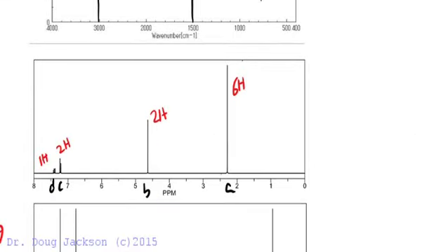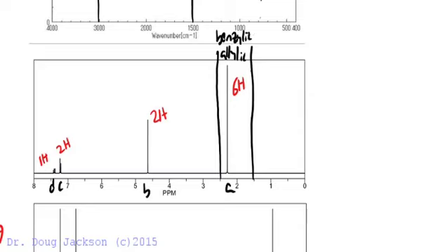And in our hydrogen NMR, we draw our line. So this is the alkyl region here, the allylic, or in our case here, allylic slash benzylic terminology. Next door to a double bond or a benzene ring shifts to the same place for the most part. So alkyl, nothing. Allylic, we have something to 4.5. We have nothing in this region. And then at 6.5 to 8.5, we definitely have a dead giveaway, 3 protons in an aromatic ring. Okay, so we've definitely got it in there, and we've got to account for it in our solution.